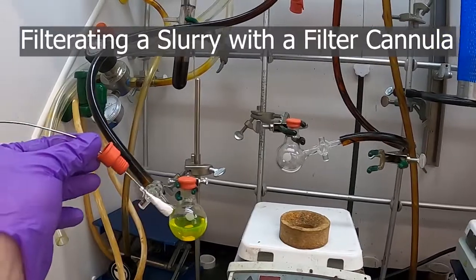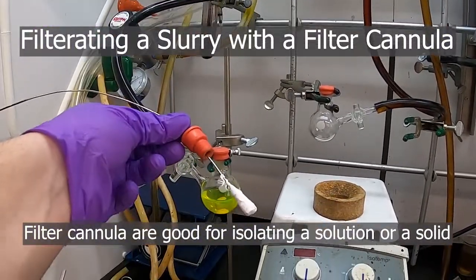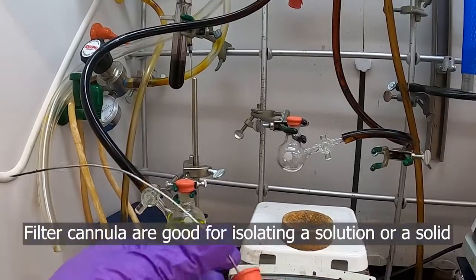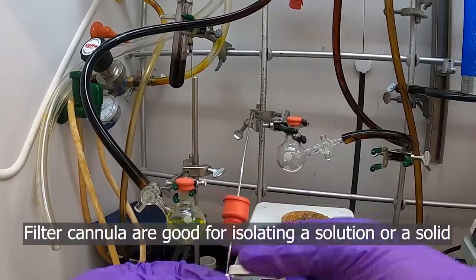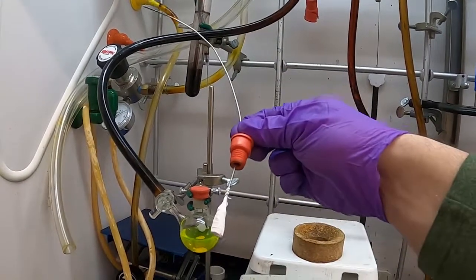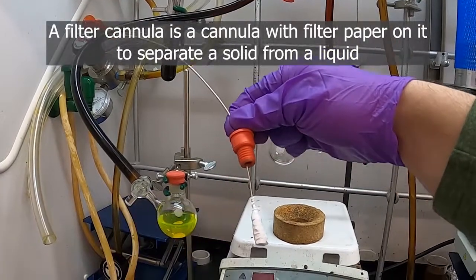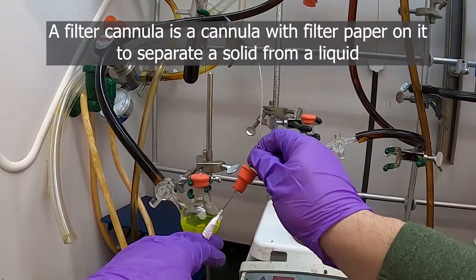If you want to retain the solid and keep it in a certain flask, one of the good ways to do that is with a filter cannula. This is one that's already been made and I'll show how to make one before I use it. It's essentially just some filter paper on a cannula or needle so that we can leave the solid behind in our flask.